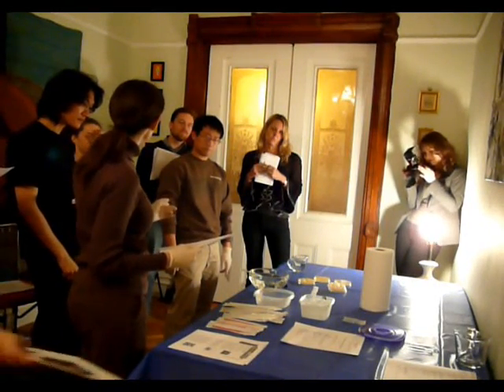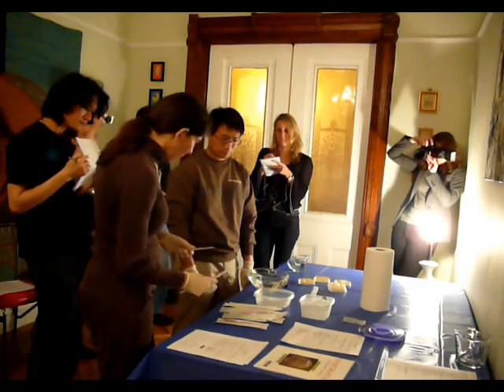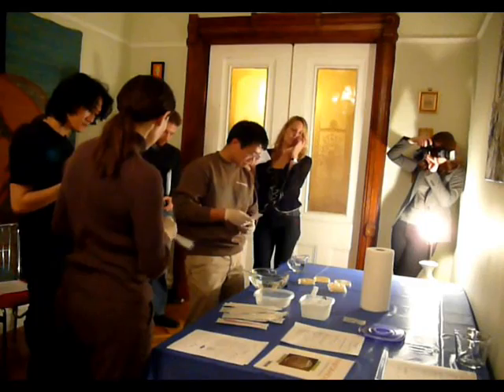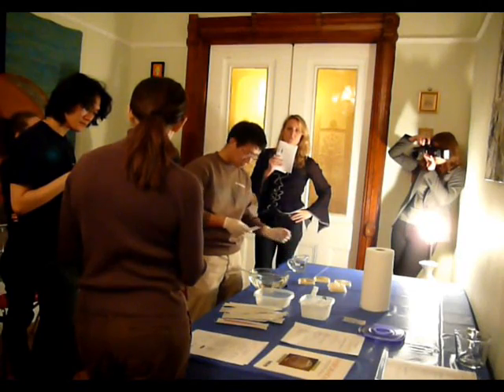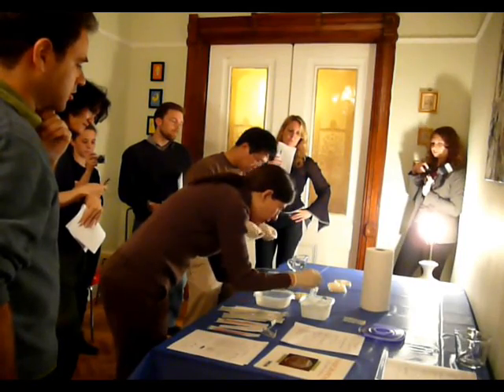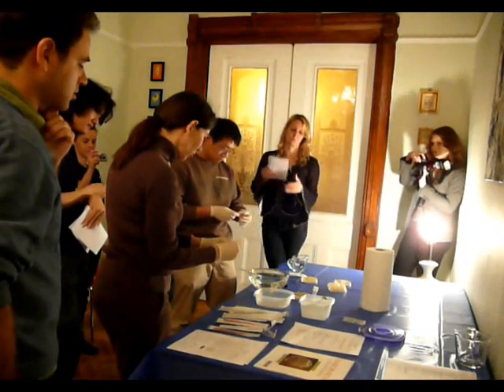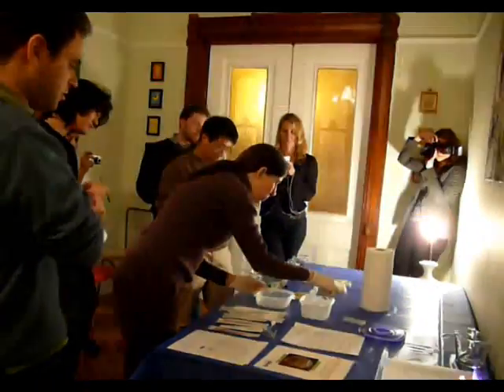So I'm going to do the first one, you're going to do the other one. For those who haven't done this before, if you have something that's sterilely packaged, obviously when you open it, you want to open the end away from the business end. We're going to open the end like that. Just think of it as having cooties — you don't want to touch the rim, you want to keep it as clean as possible.